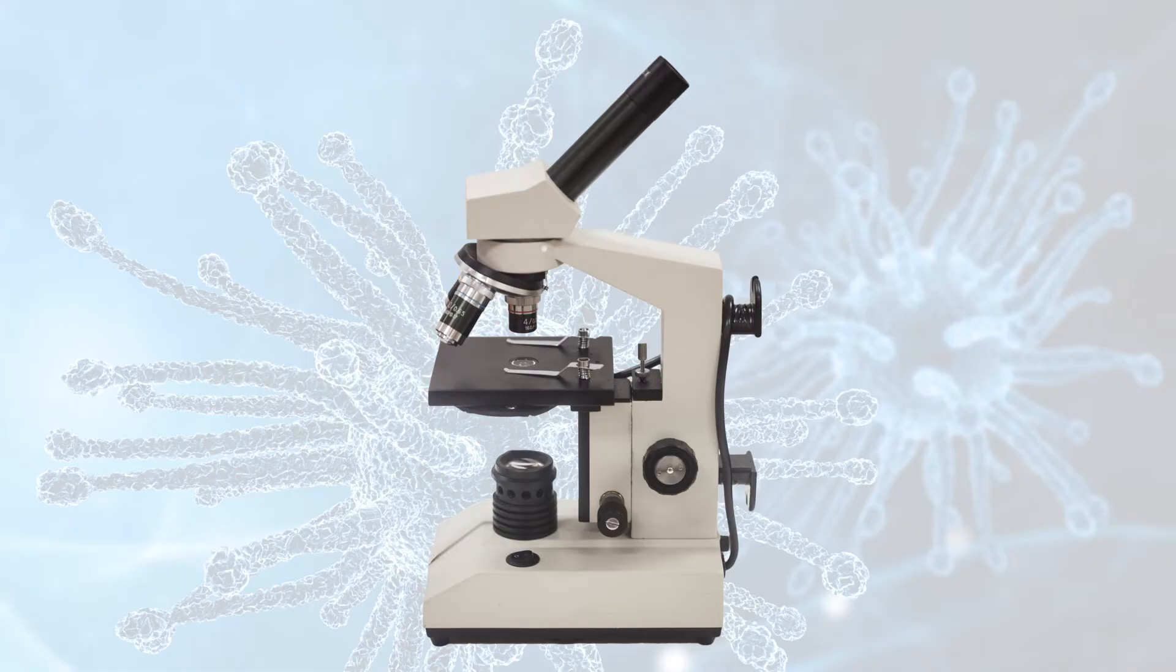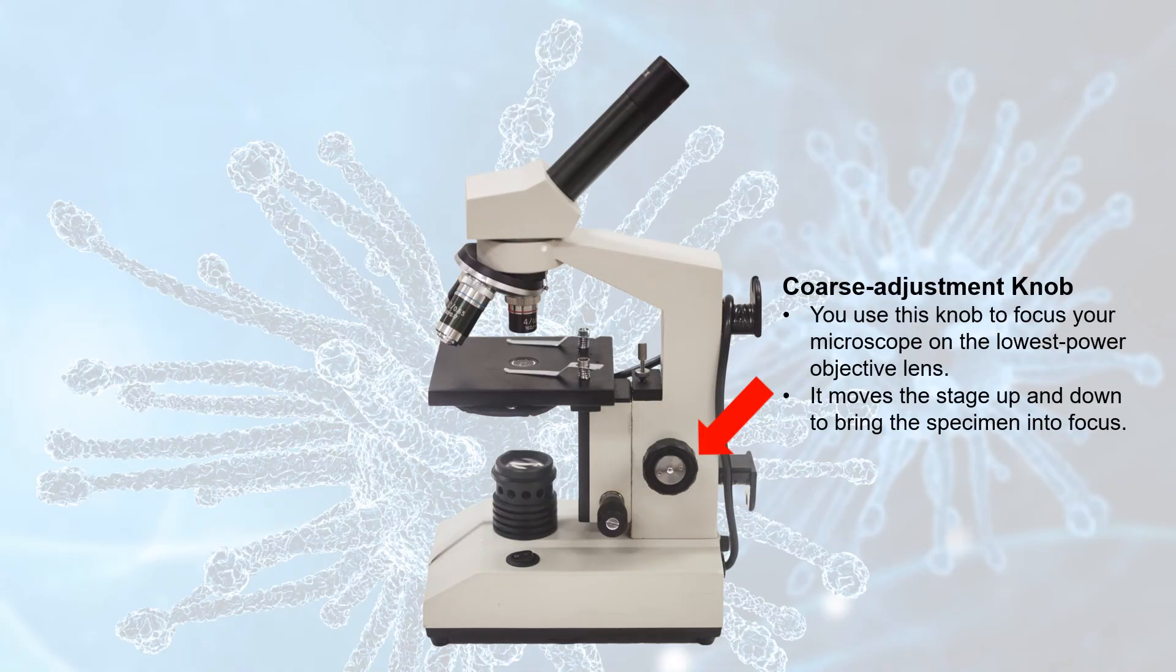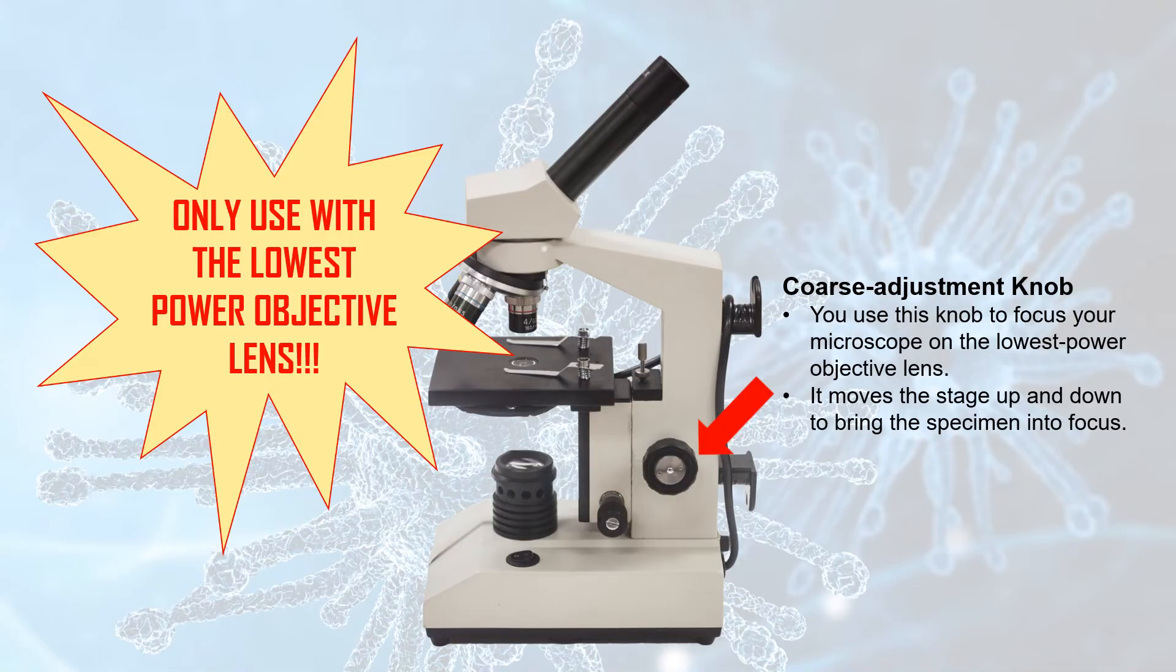When focusing the microscope to view a specimen, you can use two adjustment knobs. This one, right here, is called the coarse adjustment knob. You use this knob to focus your microscope when it's on the lowest power objective lens. Remember, that's the shortest or smallest objective lens. Now, the coarse adjustment knob moves the stage up and down quite a bit. So, you only use this knob when the microscope is on the lowest power objective lens. Otherwise, you could damage an objective lens and make your teacher cry. Don't make your teacher cry.